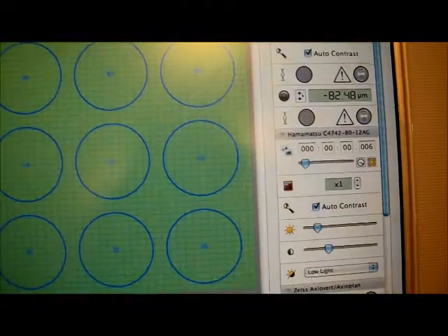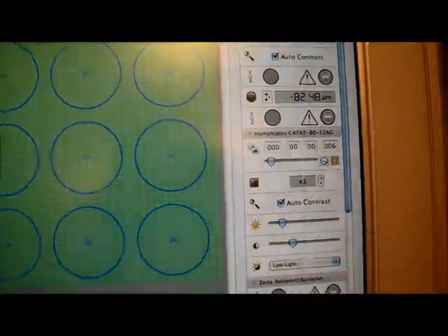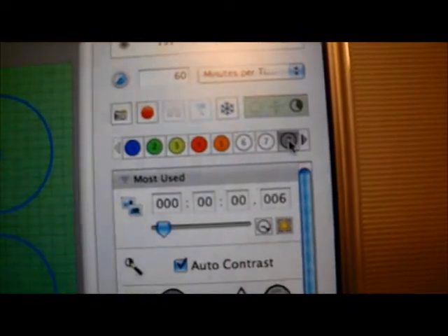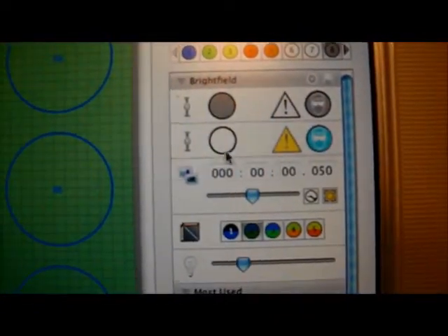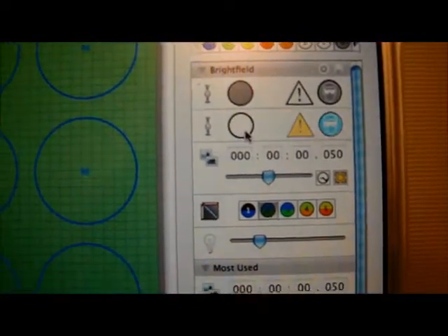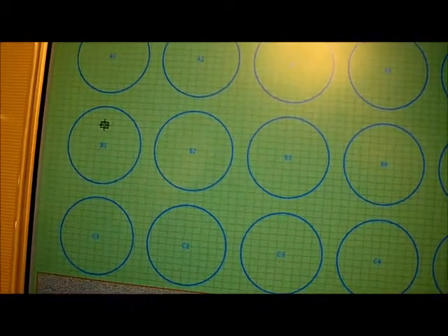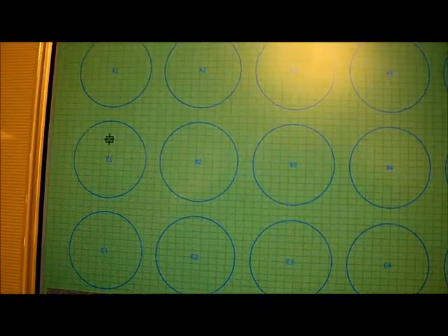Then go to bright field. So channel 8 opens the shutter as it happens. So the Ludo shutter opens. I've already calibrated the stage, so you can just move around from point to point just by double clicking on the thing here. So if we go to our first one, let's say B1, double click on B1.